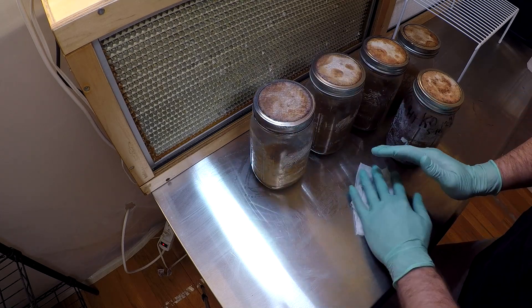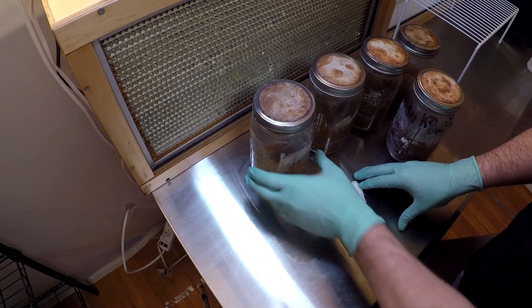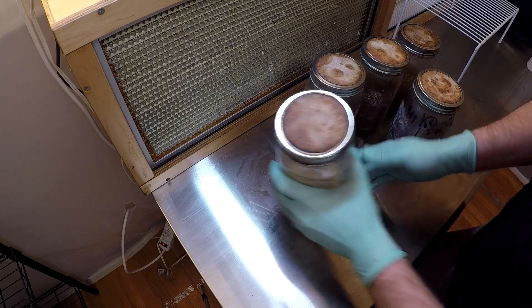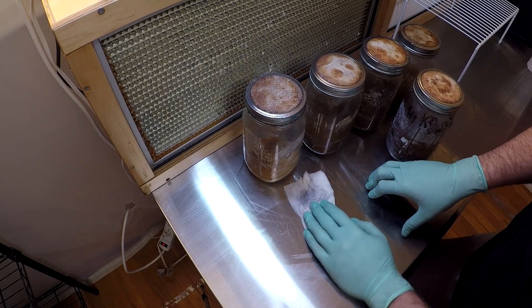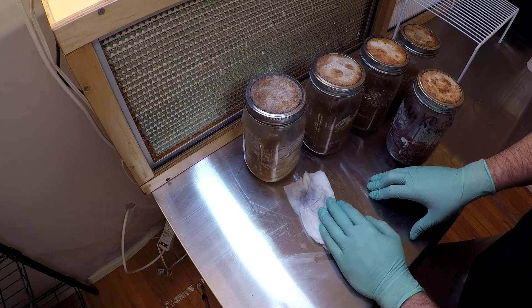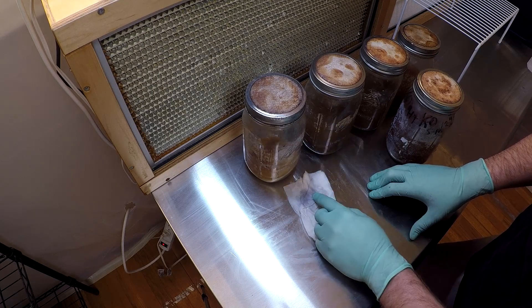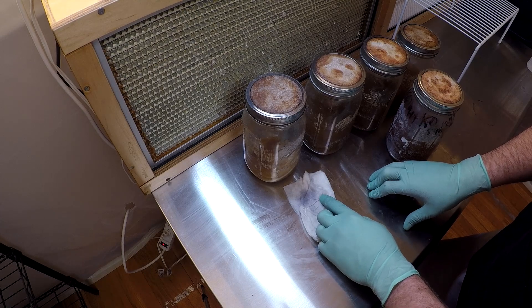About six months is when you want to always refresh something. I don't really know how long it would last — as long as it's looking healthy, maybe a year, maybe a year and a half. Somebody out there I'm sure has done an experiment. That'll wrap it up for this episode of Mushroom Adventures. I hope you've liked this improved lab setup. It's a good technique using the magnetic stir bars. I'll see you again on Mushroom Adventures.